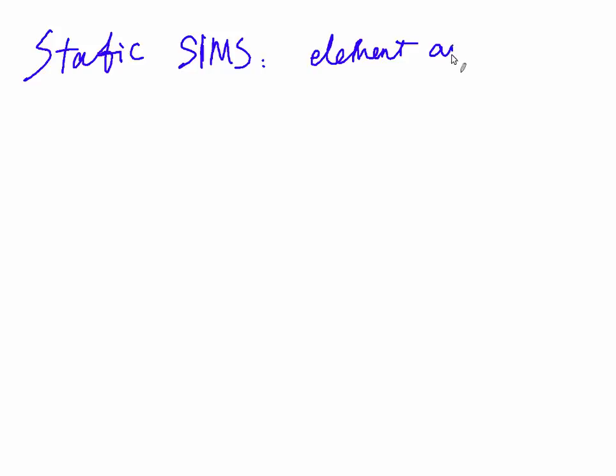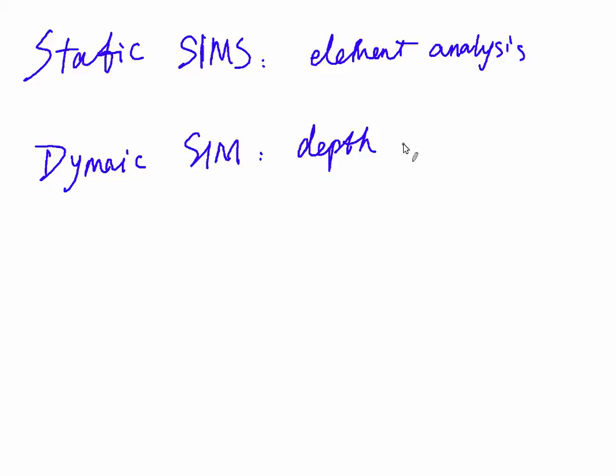We mentioned that there are two modes for SIMS tests. One is static mode. This static mode is used to do some element analysis. The dynamic mode is used for depth profiling, which can generate a 3D signal.